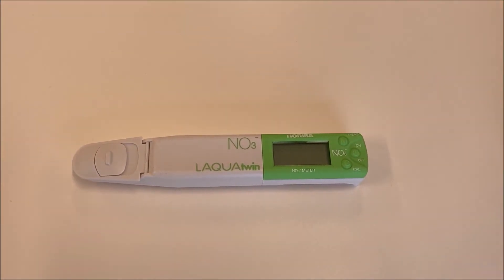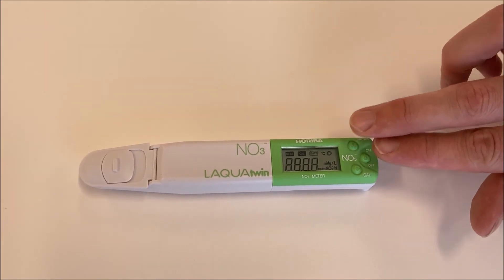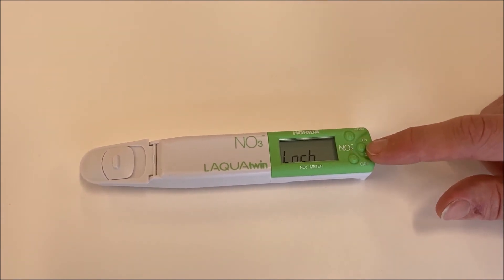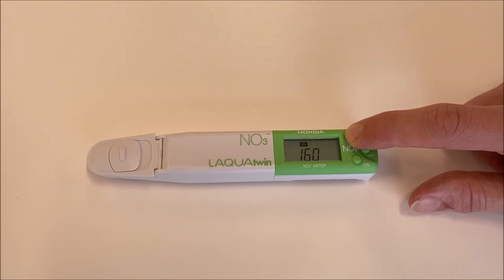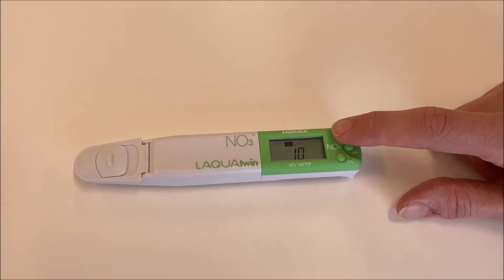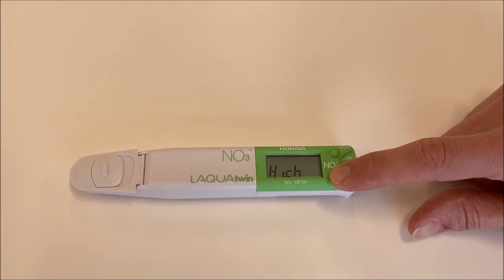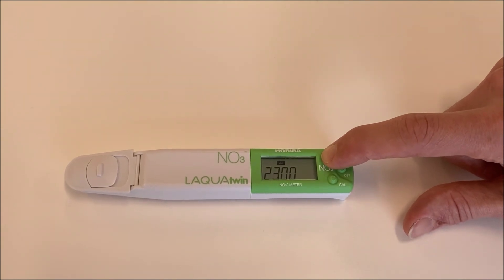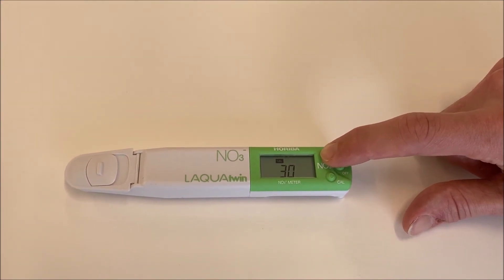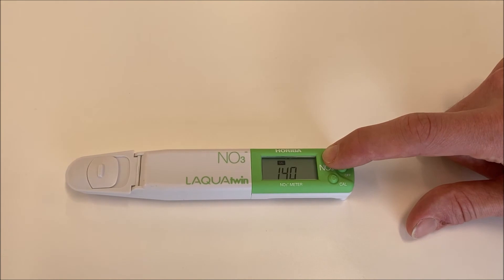Adjust calibration points with the following procedure. Switch the meter off. Press and hold the measure and on/off buttons simultaneously until the lights display. When the unit appears, press calibration one time. LO.CH is displayed on the screen. Press measure one time — 150 displays on the screen. Press measure to adjust the low calibration point value. Holding the measure button allows fast forwarding. Set the desired value, then press calibration and HI.CH appears on the screen. Press and hold measure to adjust the high calibration point to 10 times the value of the low calibration. Display the desired value and press calibration four times to switch off the meter.